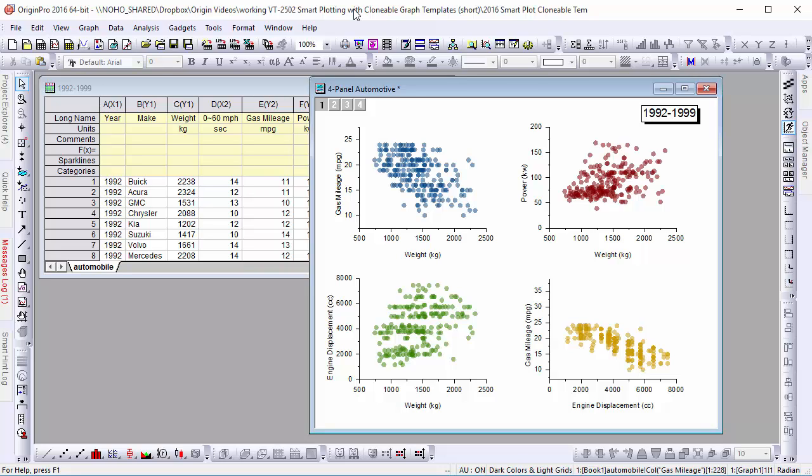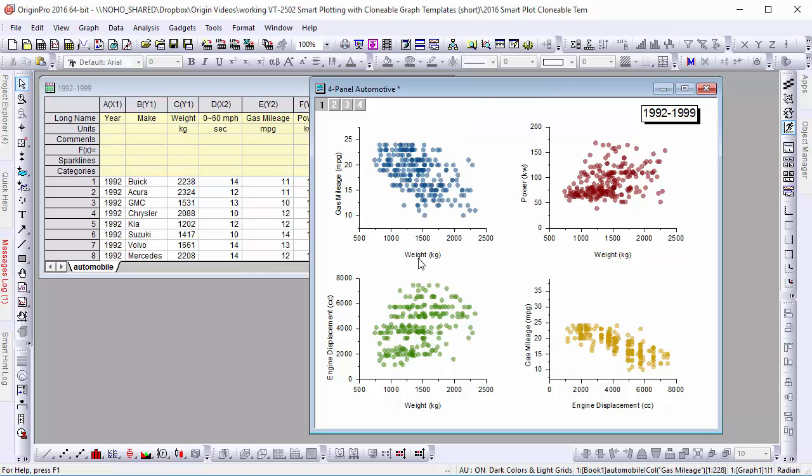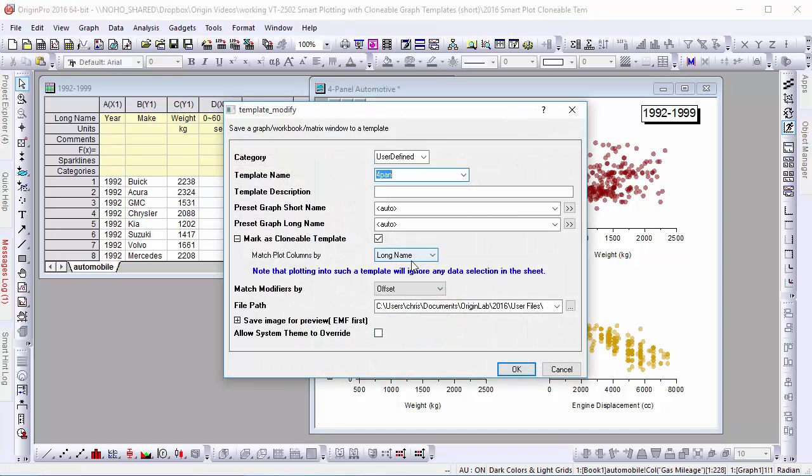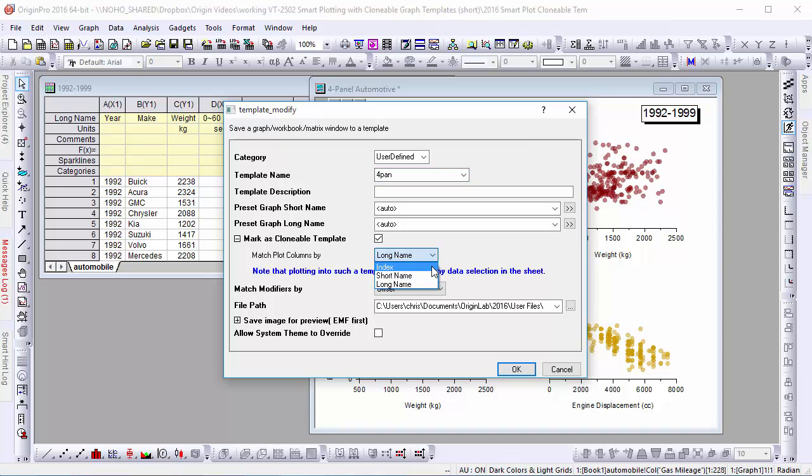Let's create a Clonable Template from this graph. When saving the template, we'll make sure to mark it as Clonable. We also need to tell Origin how to remember the data structure by matching column index, short name, or long name. Let's use the default long name.